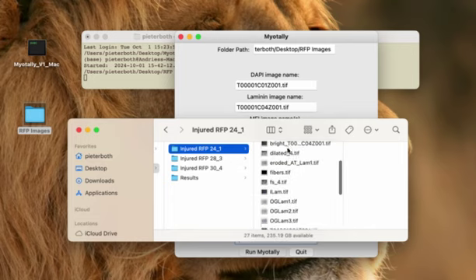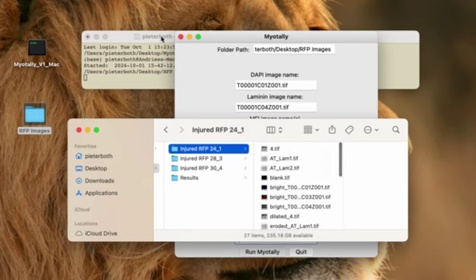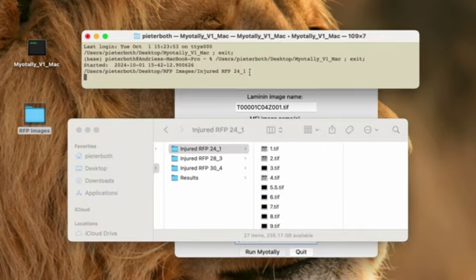And we can see here there's activity going on in this folder. And if we look at our monitoring window, the name of the image folder that is currently being processed shows up on the bottom line. And once the image completes processing, it'll move on automatically to the next image folder, and then that image folder will show up in the bottom line.